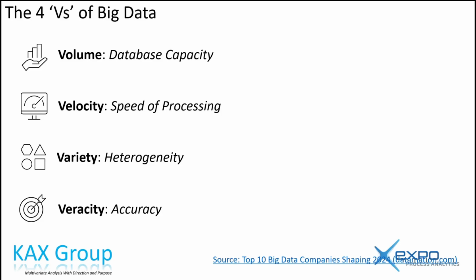And that's why these big data providers, that's all easy. But as soon as you go into thousands of variables, or in metabolomics, when you go to millions of variables, when you're trying to find metabolites in GCMS data, that's when your computer has to crunch for 3 or 4 hours just to generate one PC. And then if you find an outlier, you have to lift that outlier and do it again. And hope that your battery didn't run out.